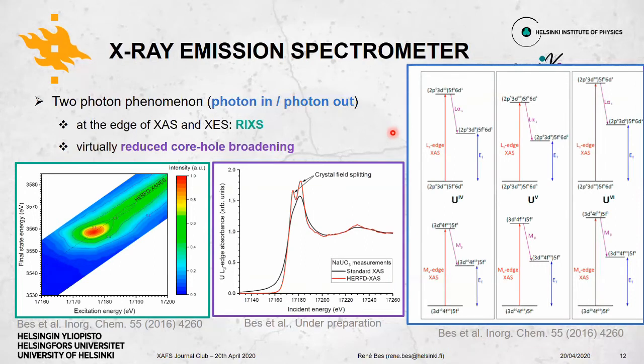I'm not sure I follow. If you do the M-edge spectroscopy, then the sample will pretty much always look thick, and you'll have strong self-absorption. Right, but here he's doing L-edge spectroscopy, but with the M-line being used for detection. I don't think that's right. What line are you using?